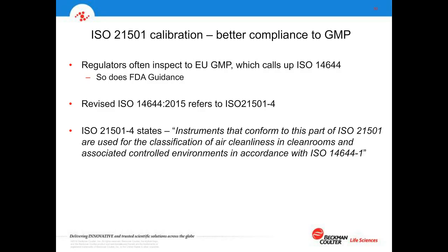Not instantly. I think regulators, even though they are very demanding, realize that it takes an industry some time to come into accordance with changes in the standards. So they're expecting this, and they expect if you don't have currently satisfactory performance of the instruments, that you have a plan in place to get there at some reasonable point in time. Next year, maybe it's a matter of budget, of course, for a lot of instrumentation. Next year, you've got this plan in place to get the instruments upgraded so that they will meet the calibration standards.